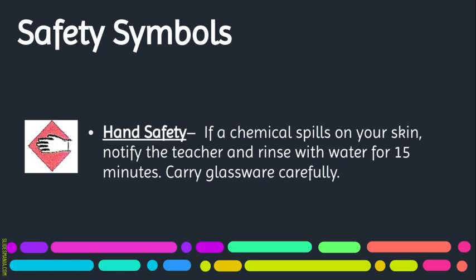I will always talk about the safety of each lab before we start the lab. It'll be written on the lab sheets. So you will know ahead of time if this is a chemical you have to work with carefully. And if that's the case, I would probably provide gloves for everybody.